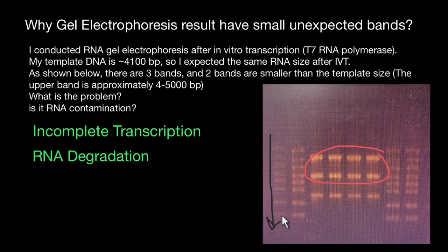You should handle samples carefully to minimize the risk of RNA degradation. Another reason can be RNA contamination. Contamination with smaller RNA molecules from external sources can also lead to the presence of smaller bands. This contamination can occur during sample handling, pipetting, or through airborne RNases.